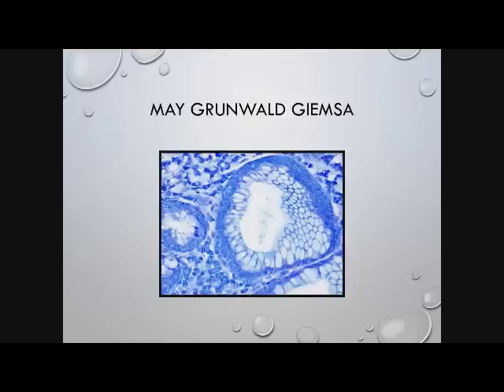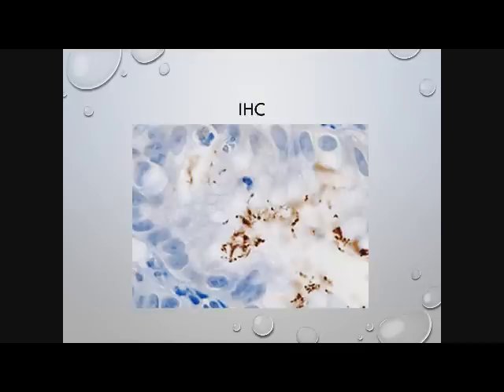done now in the laboratories as far as screening tests before you go to IHC for H. pylori. Do you immediately go to IHC if you think you see it in the H&E? Because most pathologists will see tracks of it in the H&E. Or do you go to a silver and a Giemsa, and if those come up negative, do you then go to the IHC? I would really love to know something about that. See, there's the IHC, which of course is more expensive.